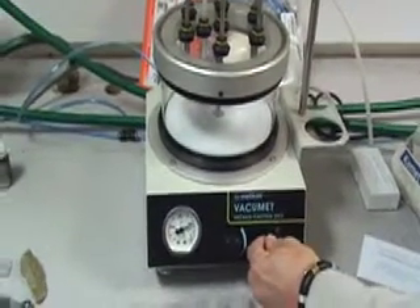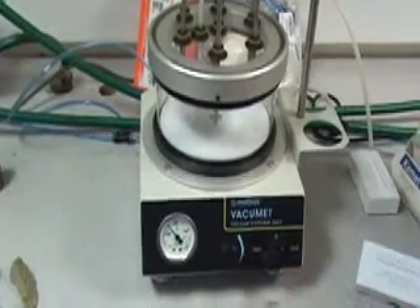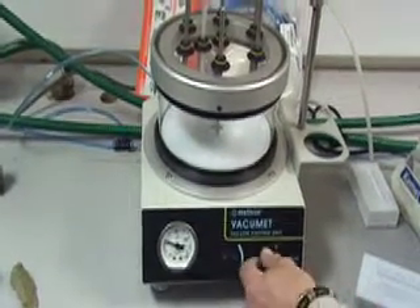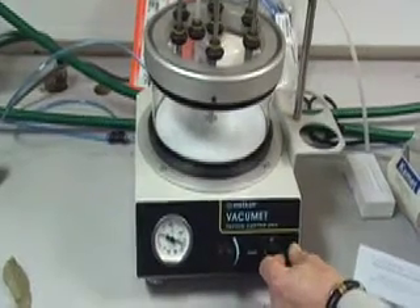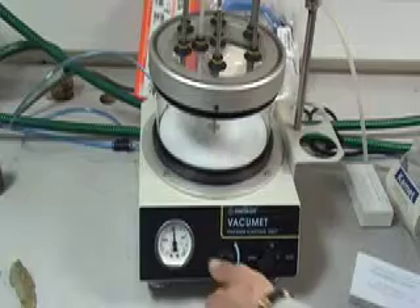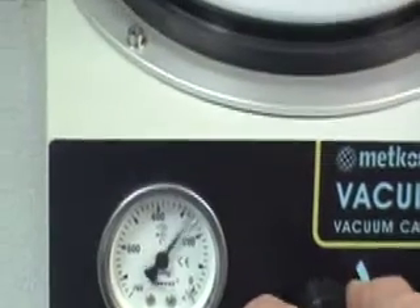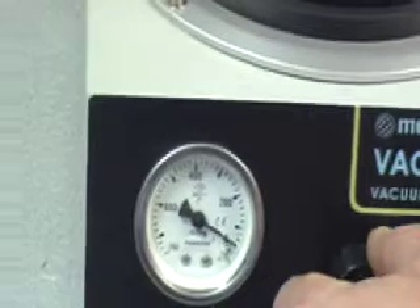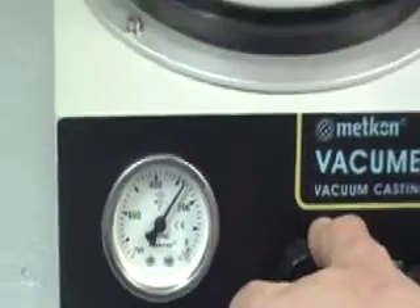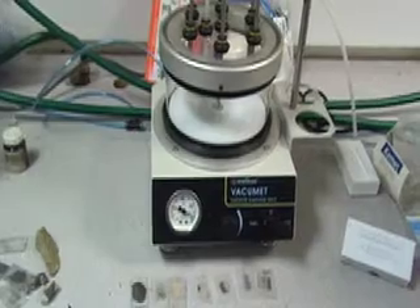Turn back on and do this three or four times. After your third or fourth go, reduce the pressure to between two to three hundred on the scale and leave for approximately half an hour. At the end of this time, turn off the unit and allow the resin to cure.